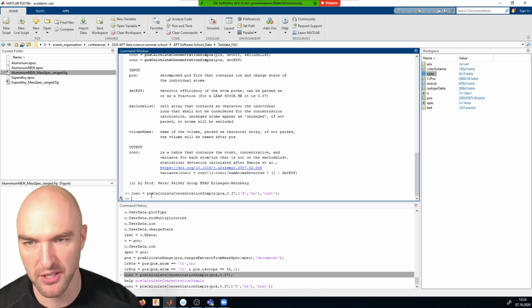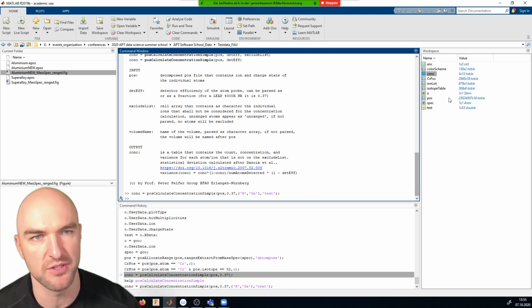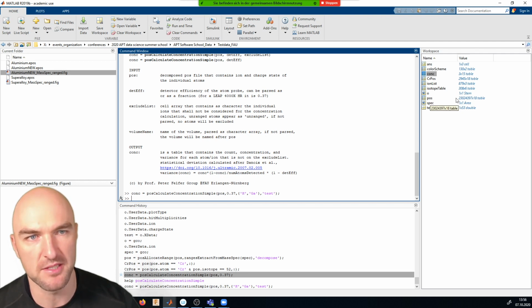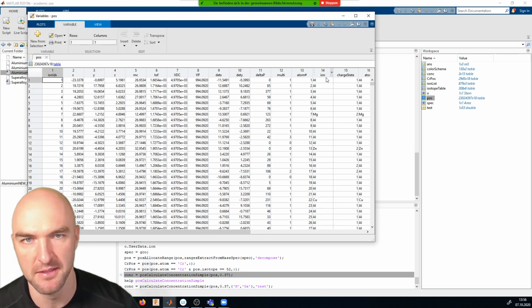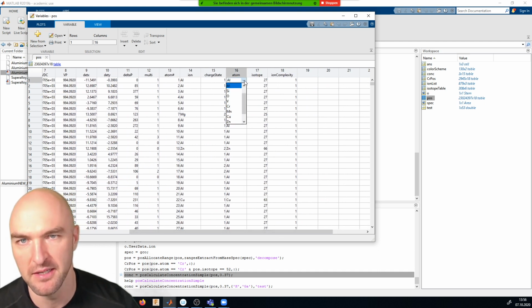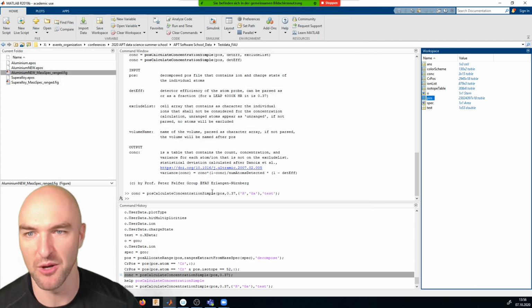And you can see that the calculation is very, very fast. The reason why it's so fast is because it uses built-in functions that work on the basis of the categorical array that's behind the pos variable. So here, if you look into the atom section, this is a categorical array because here we have categories of the atoms. Obviously, you can go and change the categories. So this allows you to do anything you want.